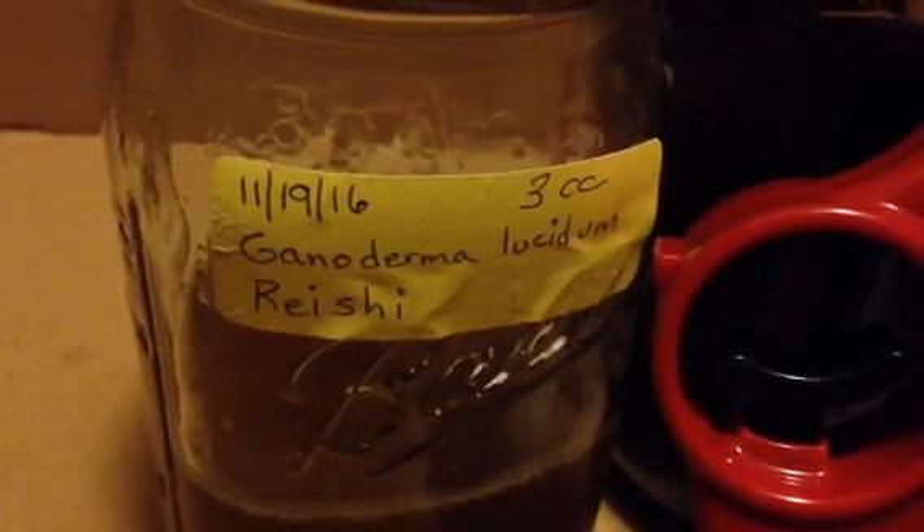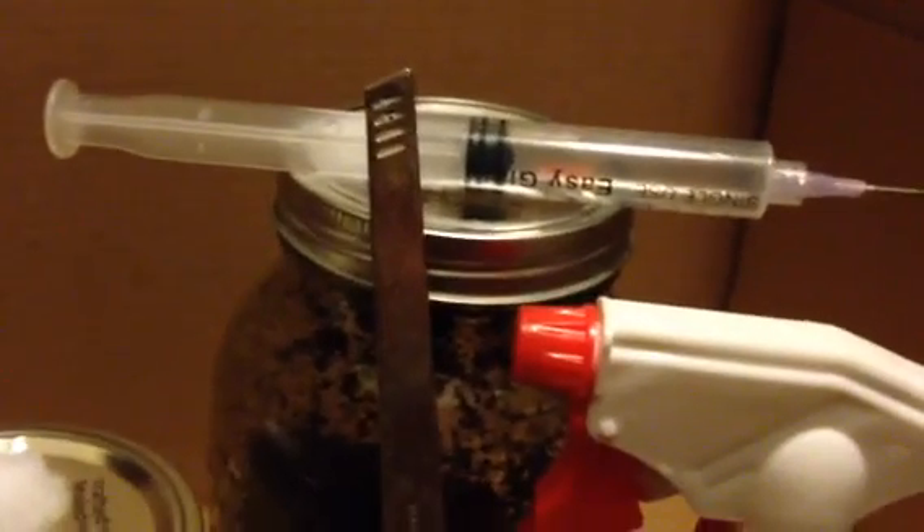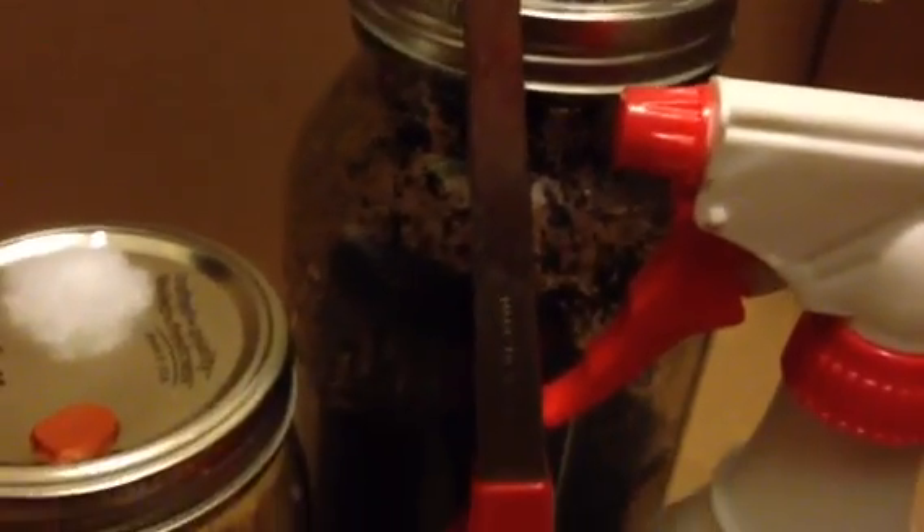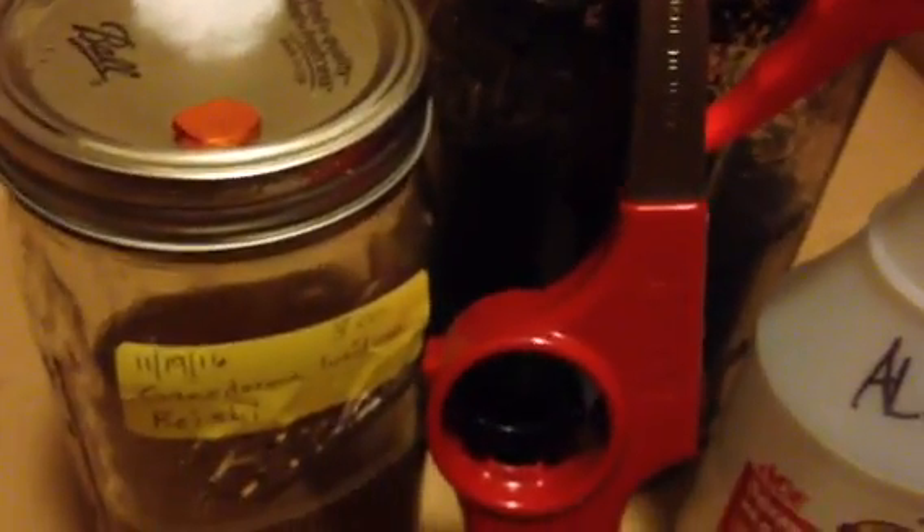We're starting with Ganoderma lucidum liquid culture that's been growing for about a month or so, and that's being put into a substrate of sawdust and bran and some wood chips, gypsum, and perlite. We've got some alcohol here to help sterilize.